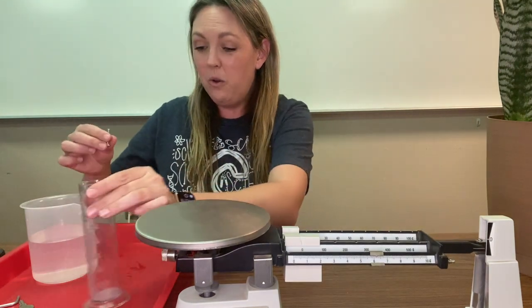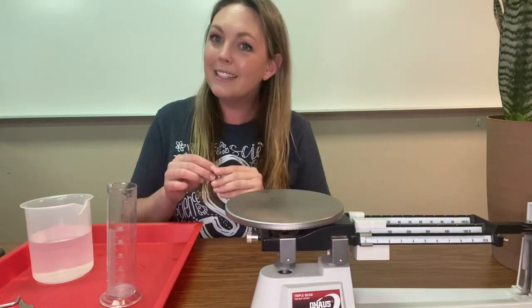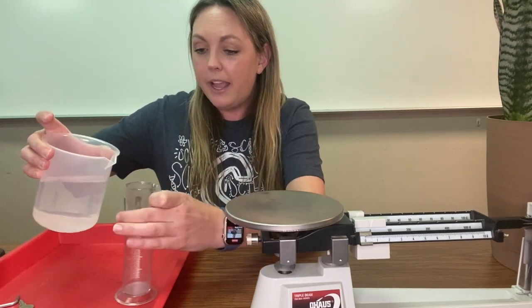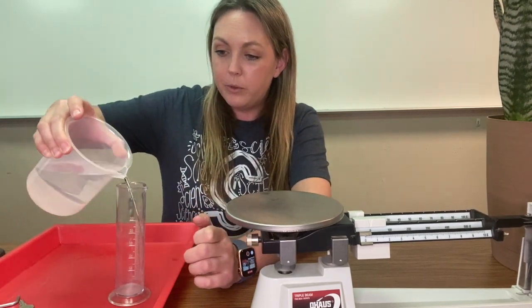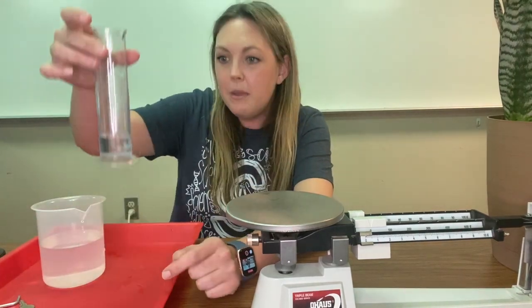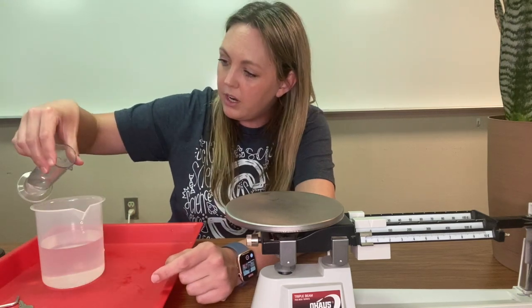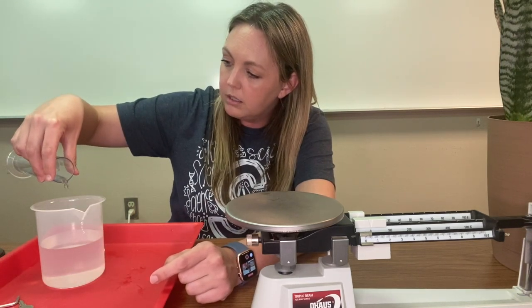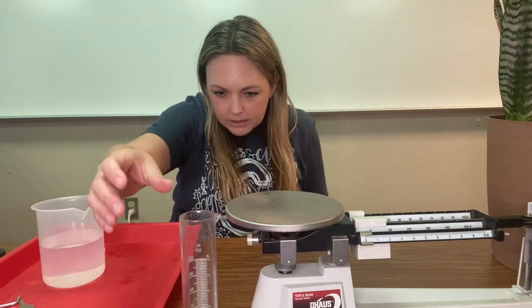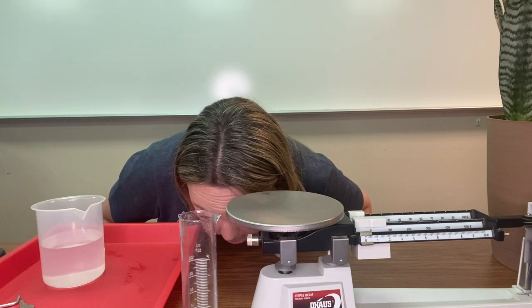So now we want to measure this same object's volume. Got to zero it out when you're done — six and two tenths grams, remember that. I'm going to put some water inside of my graduated cylinder — not much. And then I want to measure where the water started. I'm going to try to put it on 20. It looks like it's more like 24.